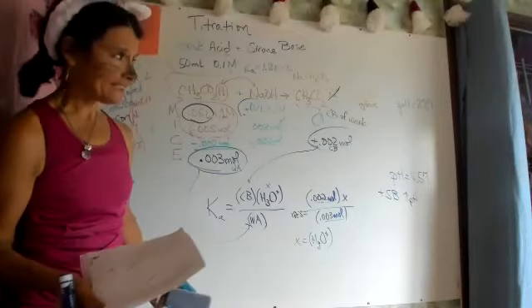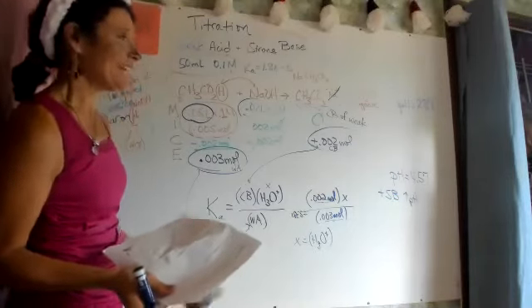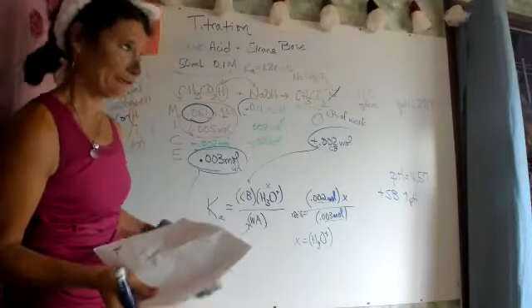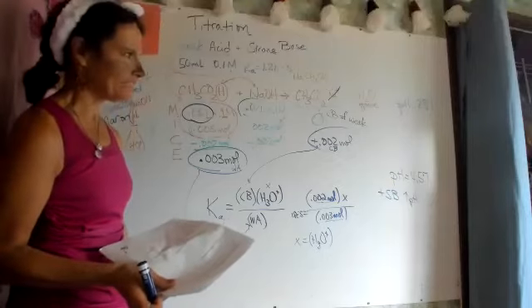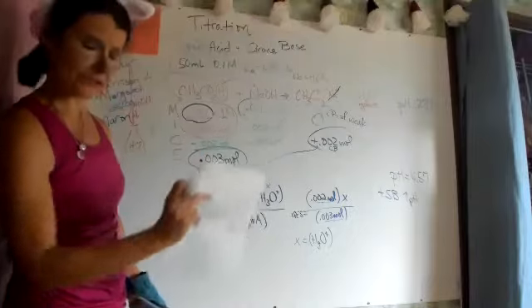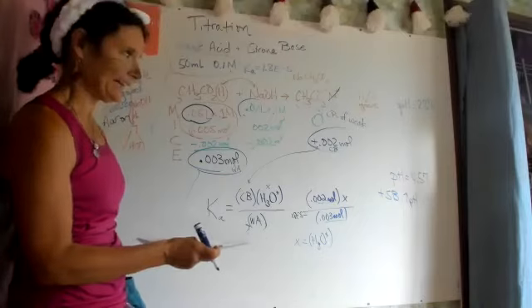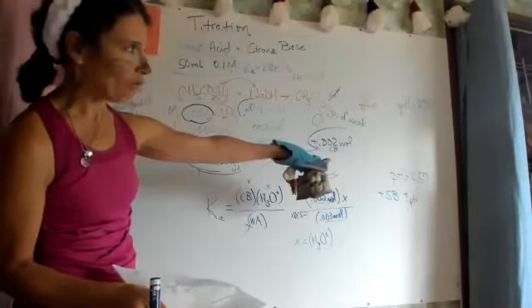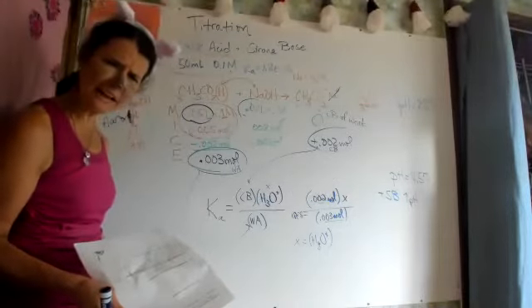Now this, I'll ask it, maybe somebody sees. The pH is going up much faster than on the previous page. So on the previous page, we started at 1, and before we hit that cliff, that straight up and down, all it got to was 2. We keep adding and adding and adding, and here we started higher, and we've almost gone up 2 whole points. Why are we changing faster?